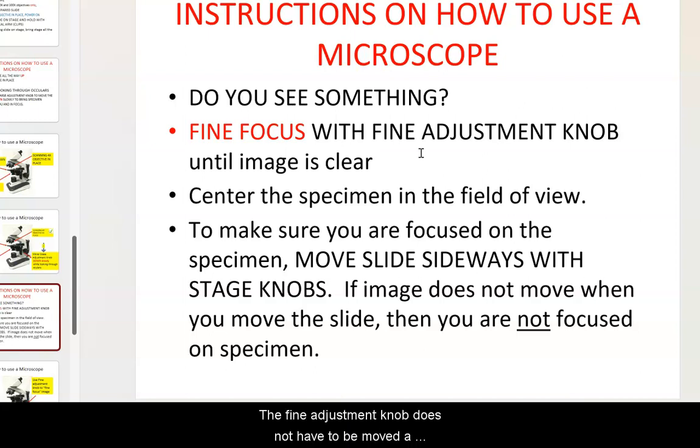The fine adjustment knob does not have to be moved a lot to make the specimen clear. Just a slight movement should be able to clear the specimen. Remember to center the specimen in the middle of the field of view.